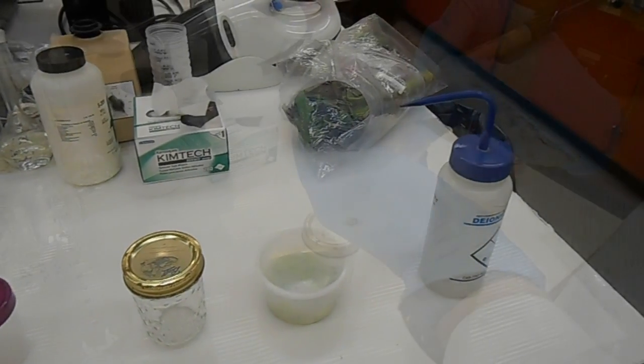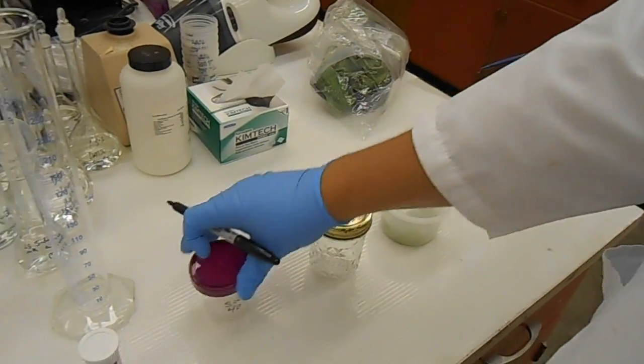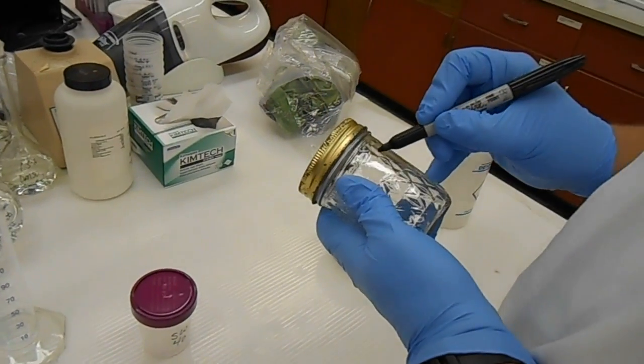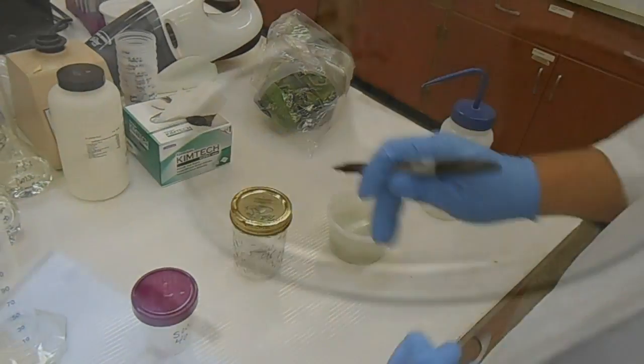a small specimen cup or a small mason jar, some sort of apparatus to measure the volume of water needed, and of course some pure water like distilled water.